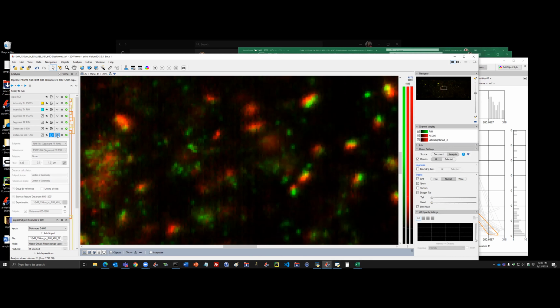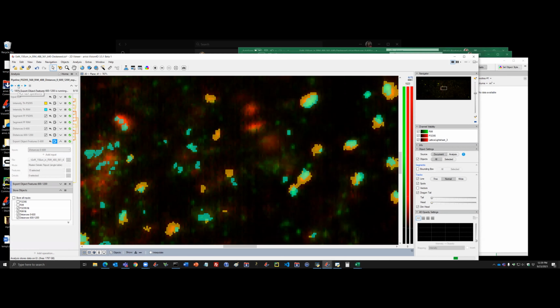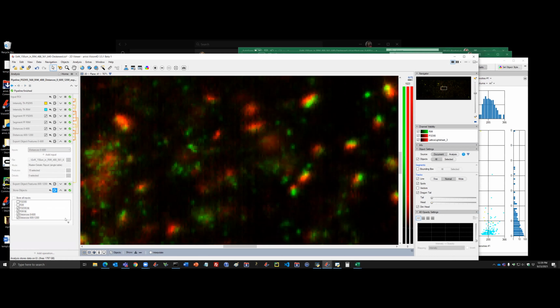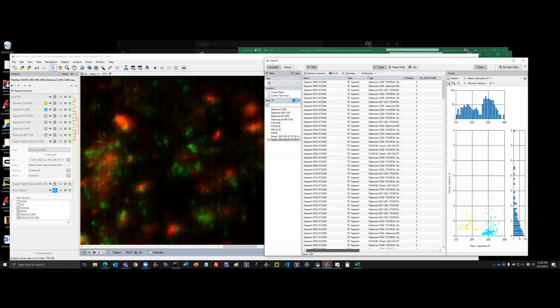So to export the features, we can basically give the path and the file name, and run the step, in this case for each of the 2 groups of particles. And as the last step, I'm basically saving these particles again into the objects table that can be accessed. It is already stored, and it can also be exported if necessary.